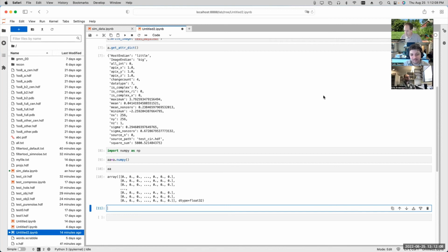I mean, sure, you certainly could store both the motion corrected and non-motion corrected, and maybe dose weighted and non-dose weighted. I mean, there's a bunch of different options there. You could put all of those in a single HDF file, but then you'd sort of have to keep track of it. I'm not sure there's a lot of advantage to putting the different types of image in the same file. If I think of my own workflows, I would probably make each of the types of files for all the micrographs and put them in a named folder, describing what it is. And then I'd sort of swap the whole folders out if I wanted to change my processing pipeline around. You know what I'm saying?